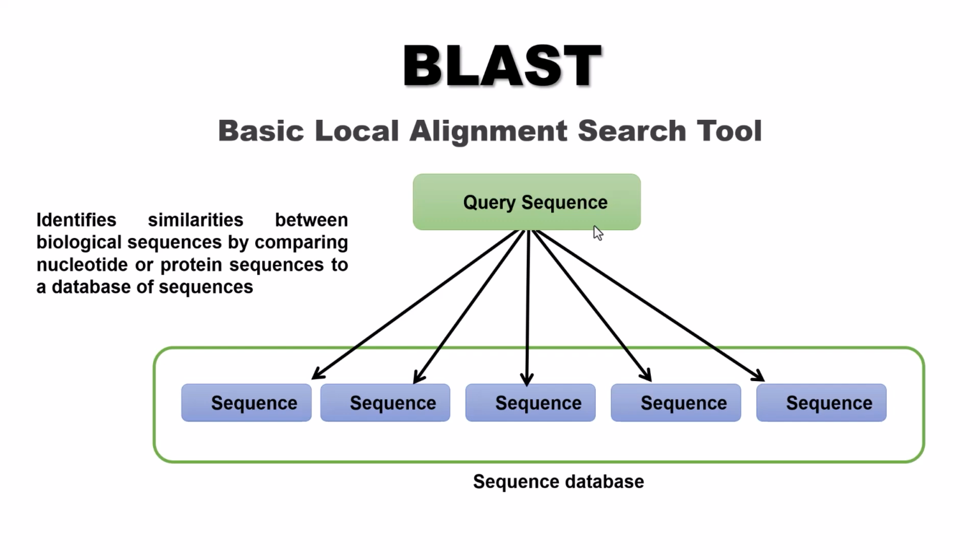To get the result, the similarity result of our sequence with the NCBI database.